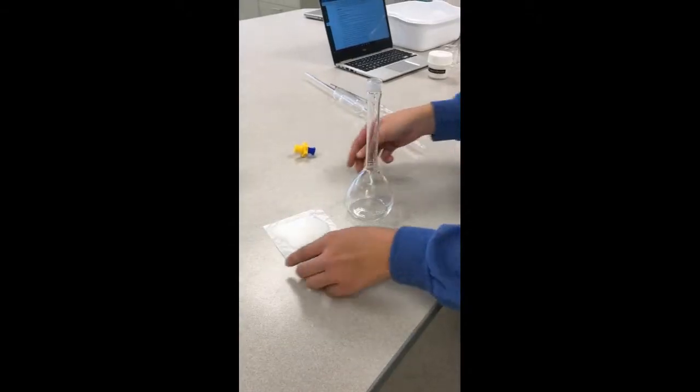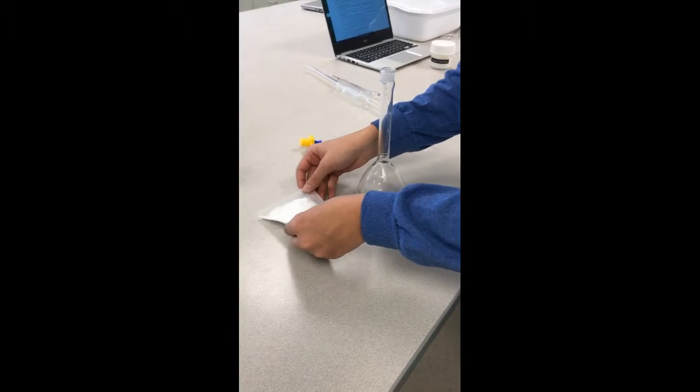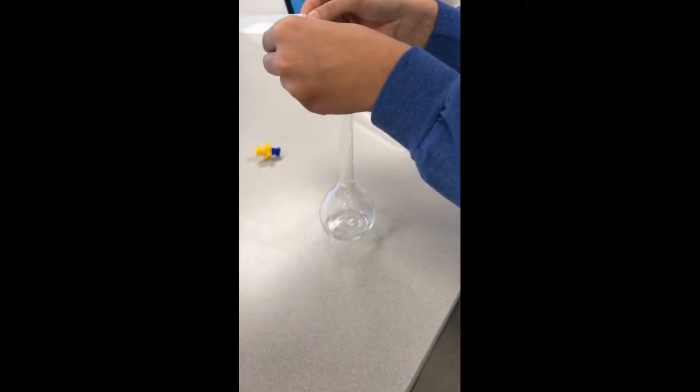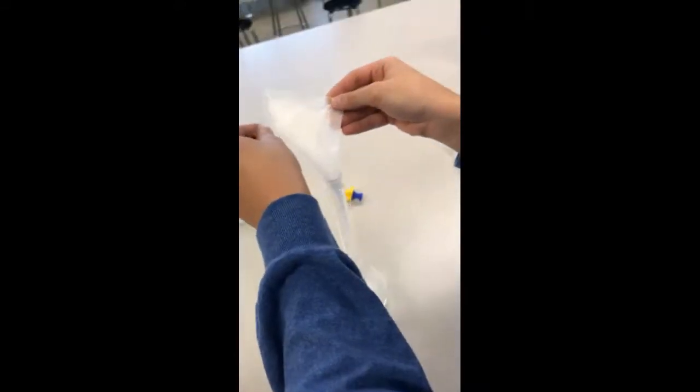So we're going to take the 29.21 grams of sodium chloride salt and put it in the 250 milliliter volumetric flask, making sure to get all of it in.